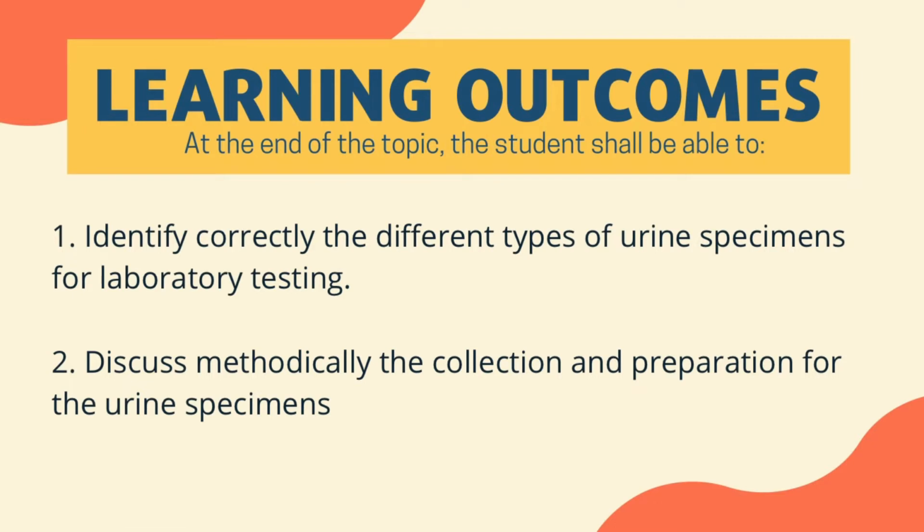Now, what would be the learning outcomes for this lesson? At the end of the topic, the students shall be able to identify correctly the different types of urine specimens for laboratory testing and discuss methodically the collection and preparation for the urine specimens.